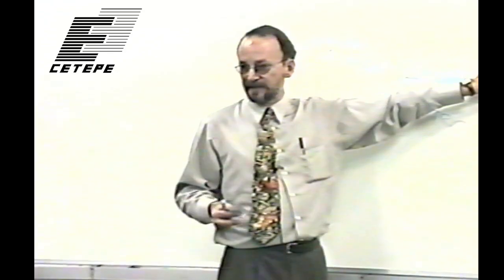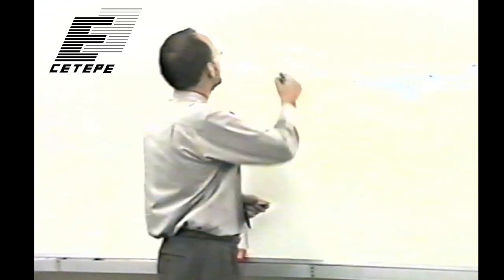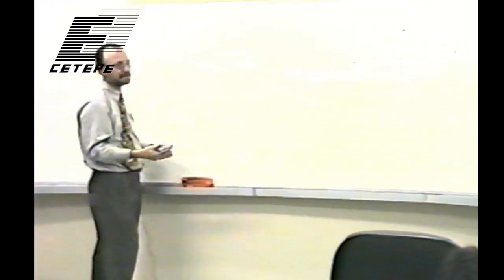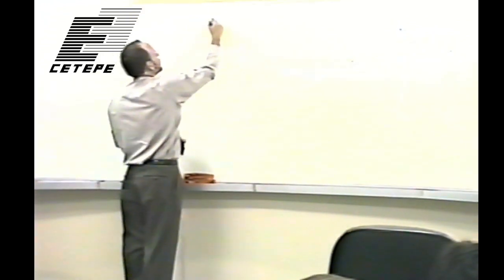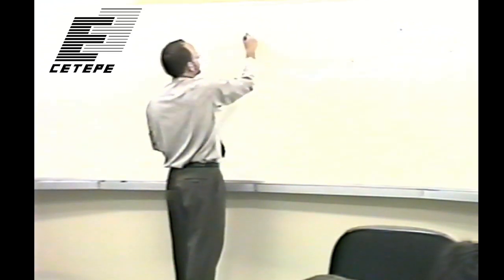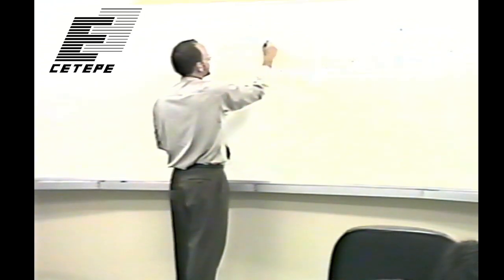So just to give you an idea about the efficiency, a really good screen will stop about 80% of the X-rays, a good screen system. So the combination of this whole sandwich here, if it's thick, will stop maybe 80% of the X-rays. So the efficiency of basically X-ray to image information conversion, there's a number of factors involved, but one is that you only stop about 80% of your X-rays.